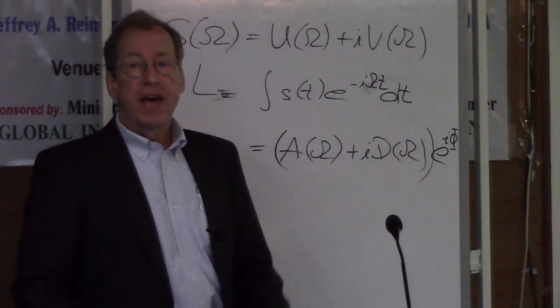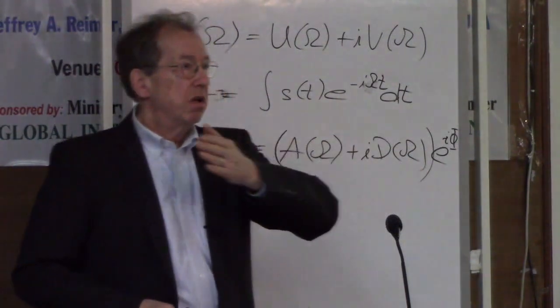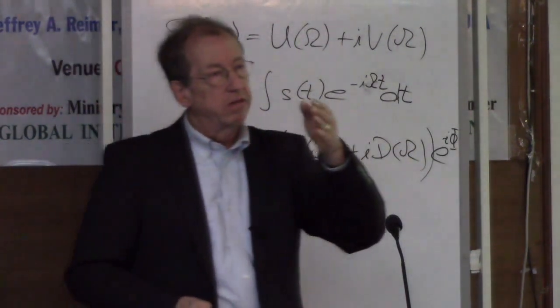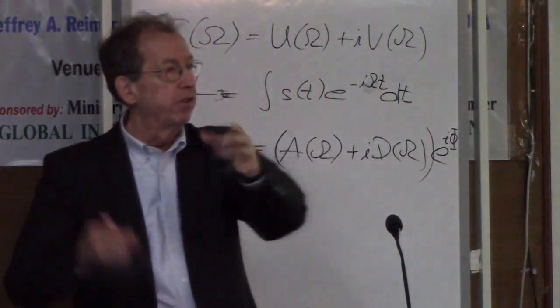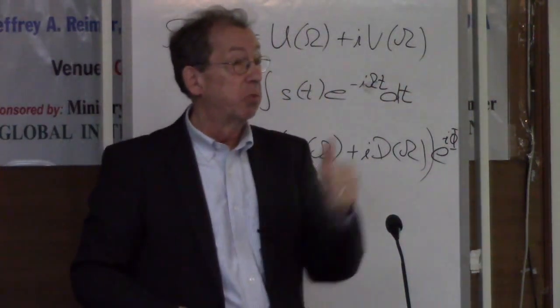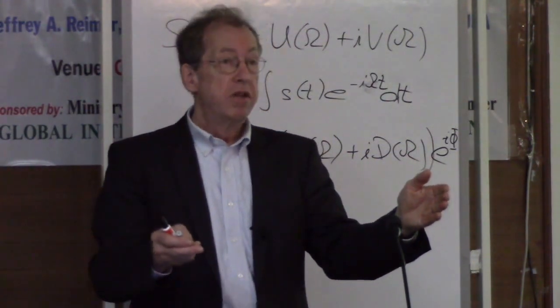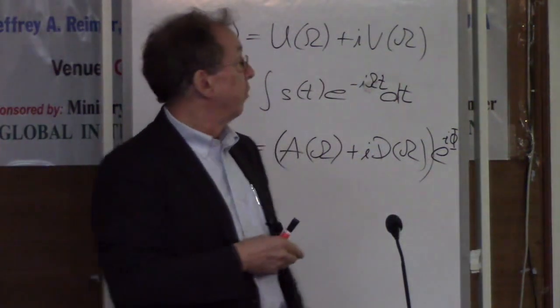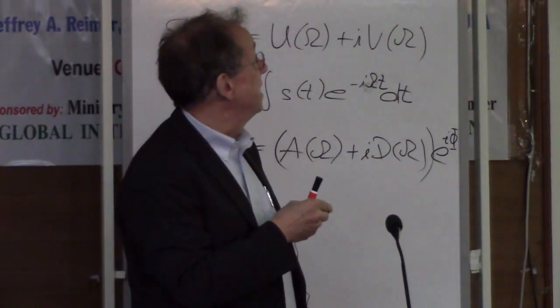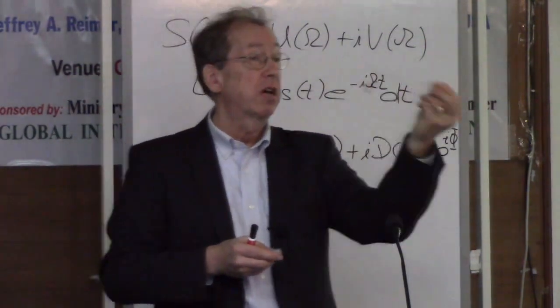That phase error comes in because the signal takes time to migrate from the receiver coil through all the different electronic components until it ends up in your computer. It's one phase error: travel time for the signal through the electronics. The other is the dead time. You don't see the beginning of the signal. You don't see it beginning at the maximum because the spectrometer is blind. It cannot detect so fast.